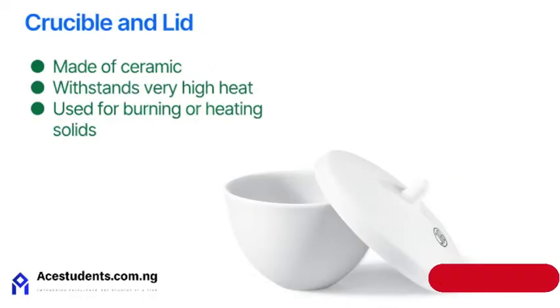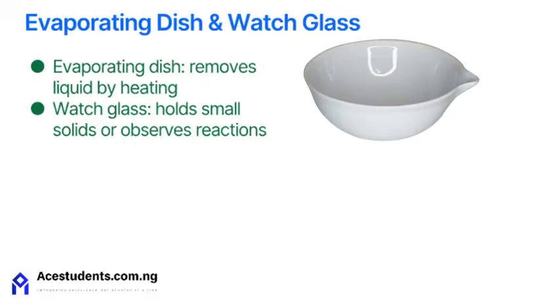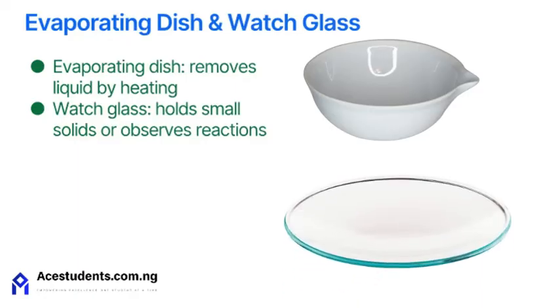The crucible and lids. Crucibles are small ceramic containers that hold substances when heating to high temperatures. The lid helps contain the heat. Evaporating dishes help remove water from solutions by heating. Watch glasses are used for viewing small reactions or covering beakers.